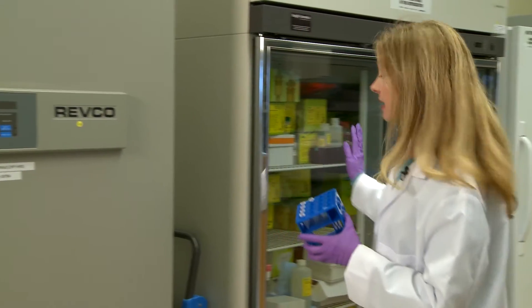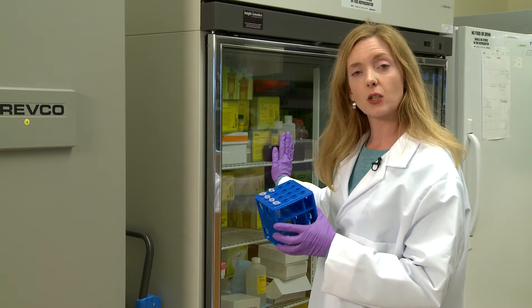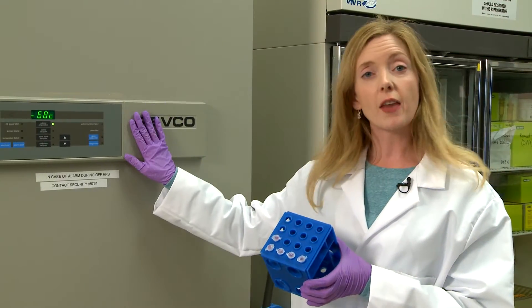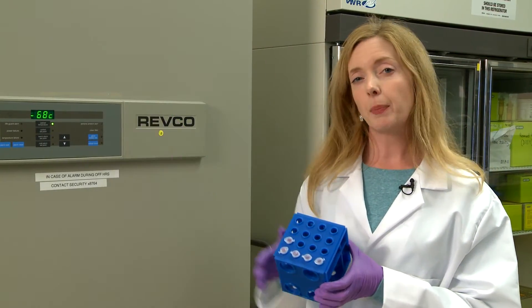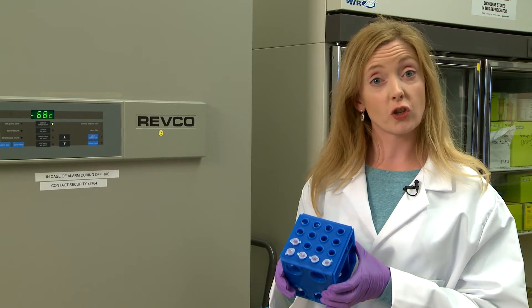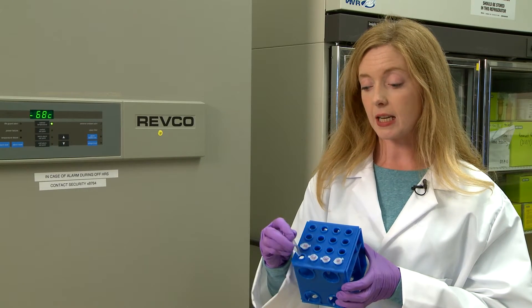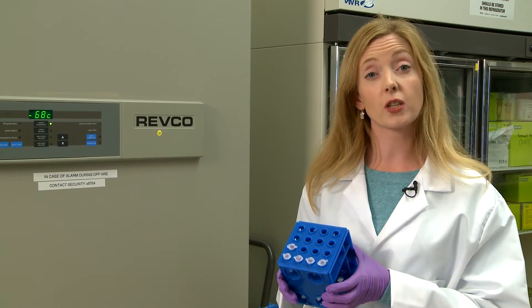First off, 4 degrees if you're going to be using it within the next 24 hours. If you're looking for longer term storage, try the minus 80 freezer. You can flash freeze with liquid nitrogen, and we recommend that you make small aliquots of your sample so that it doesn't undergo multiple freeze-thaw cycles.